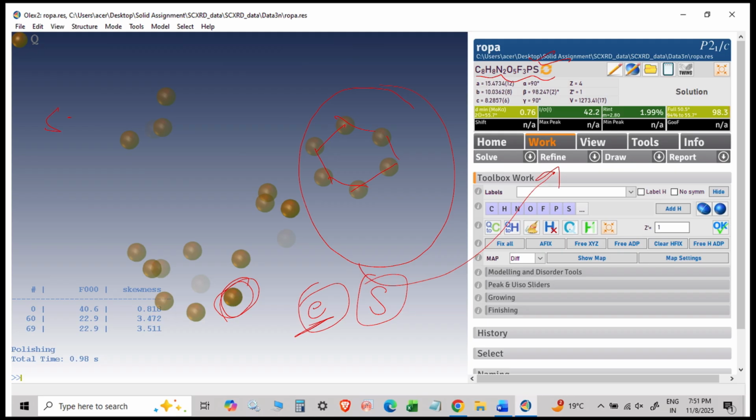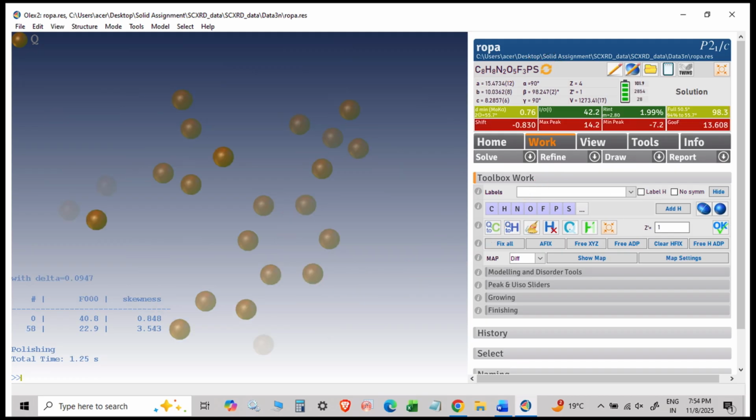I started from sulfur and got the full structure. I started from this particular benzene ring, still got the full structure. So that's up to the person how they are solving it. This is just the final rendition of it. Before getting these slides, it took me at least 5-10 iterations for each particular moiety, each particular drug. So yeah, a six-member ring we are getting here.